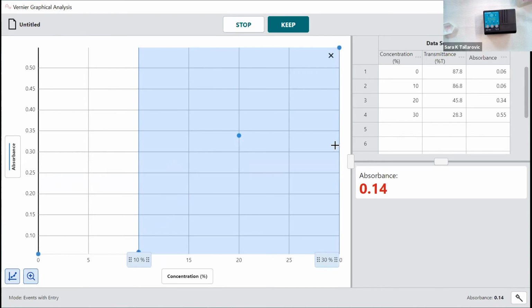You can have them try different types of alcohols: methanol, ethanol, isopropyl, anything that you have available in your lab. And then of course, I mentioned with salts, you can try different types of salt, as well as different concentrations of salts. You can try different pH ranges. There are instructions in the lab for testing pH range.